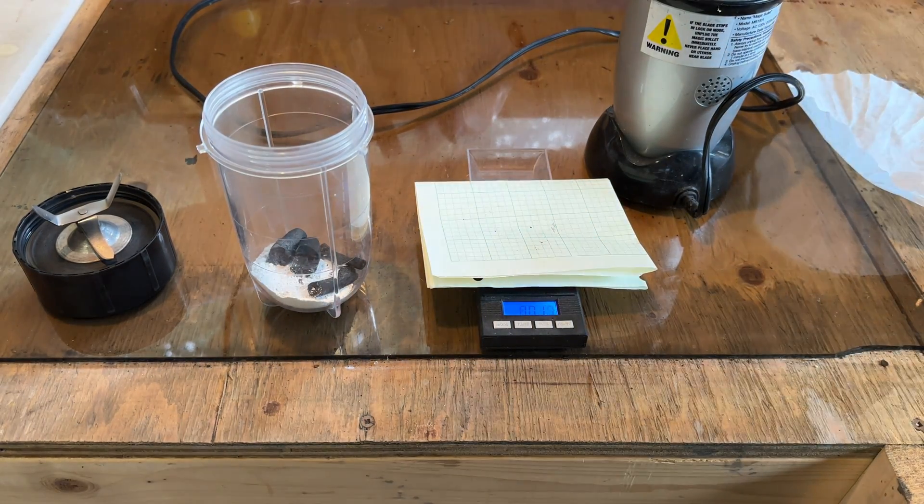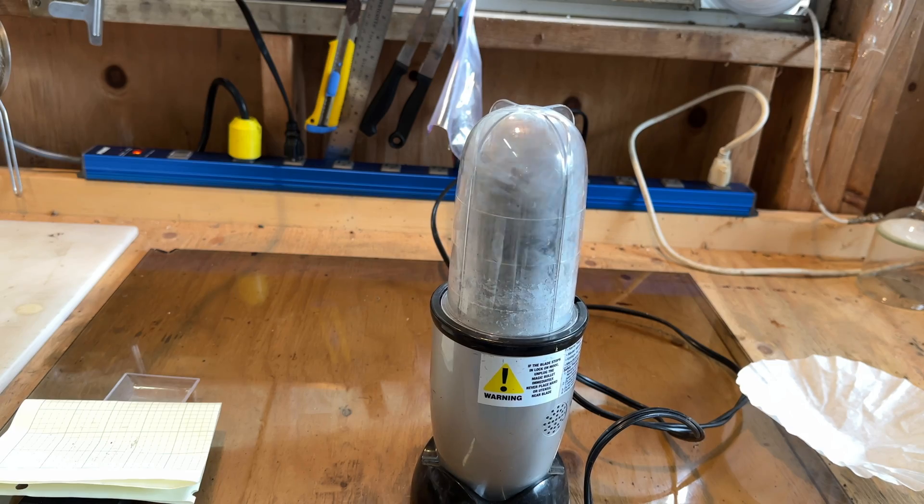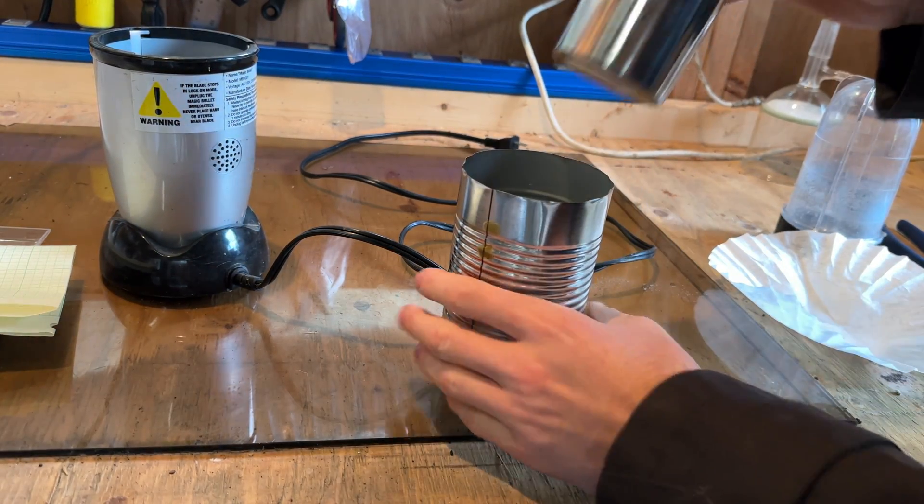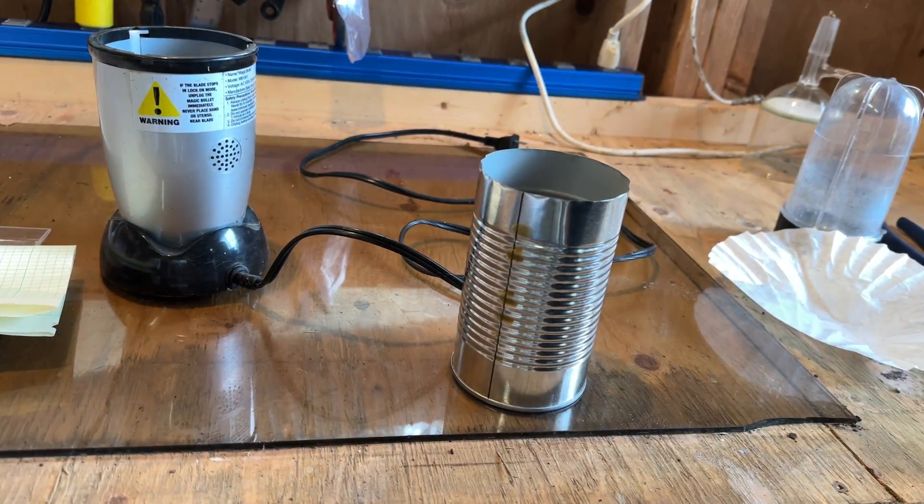These were then combined in a blender and ground together until completely homogenized. The reaction mixture was placed in a steel vessel with a lid, and this was placed inside of a tin can to help protect the inner tin from oxidizing under high heat.